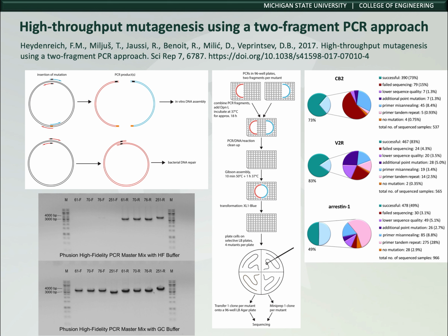The 2 separate PCR reactions amplified the 2 fragments of the target vector, and thus generated alanine scanning libraries of 400 single-point mutations in 6 weeks, with complete coverage of the protein sequence.